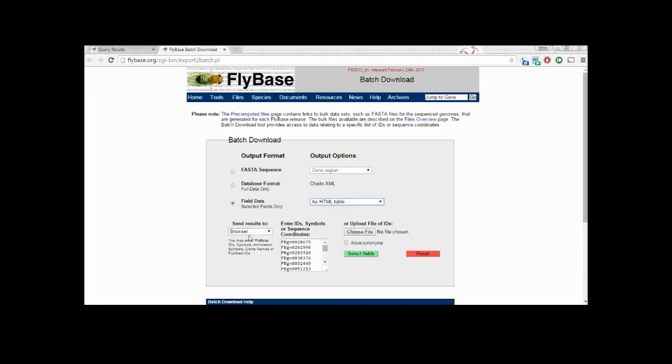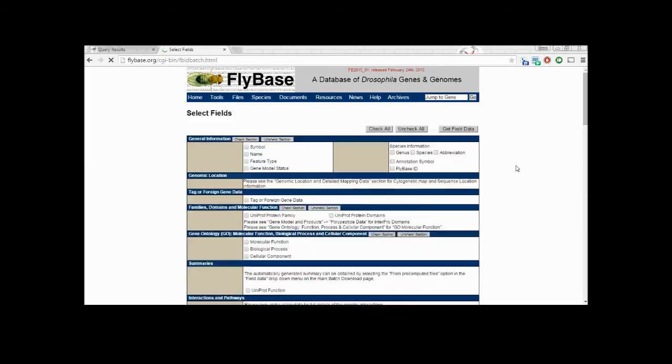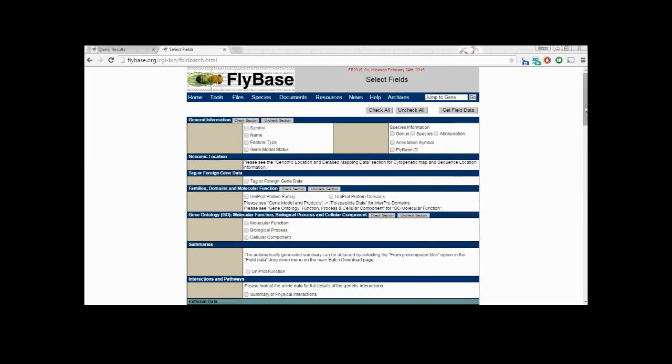This brings us to a page where we can select the table format and output type. It also automatically inserts all our genes of interest into the ID box. We click select fields and then choose what data we want for each gene.